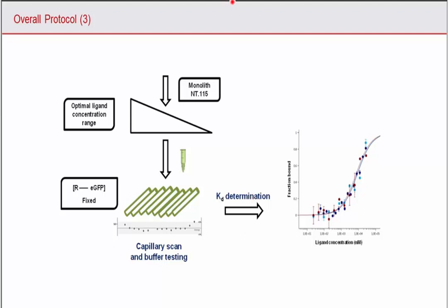So this approach is not entirely new, as GFP fusion proteins expressed in a cell line were described in the past in the Journal of Visualized Experiments. But our aim was to adapt this protocol to study a pathway, the PD-1, PD-L1 pathway, that had never been studied so far by MST, and then perform high throughput screening using this protocol.